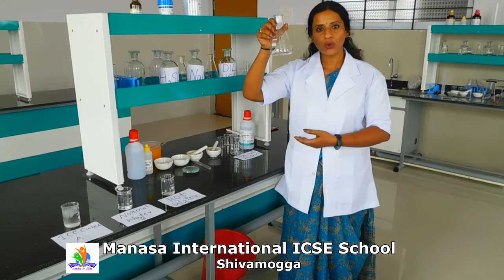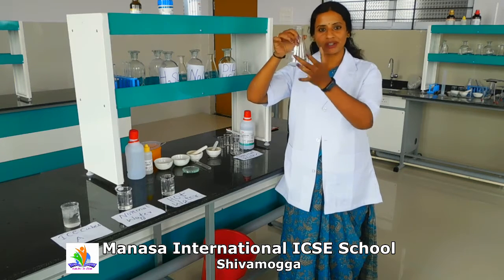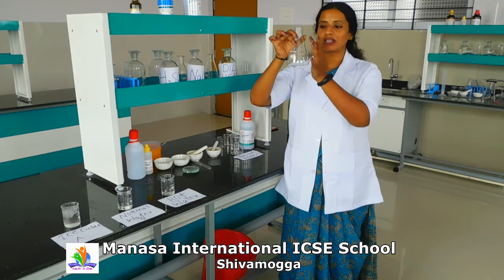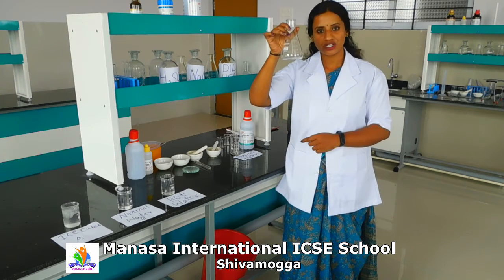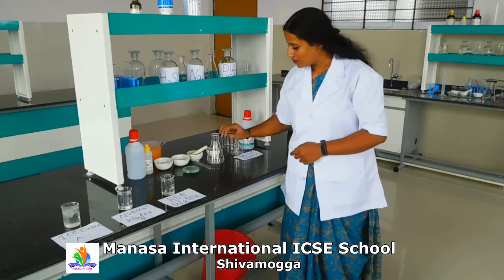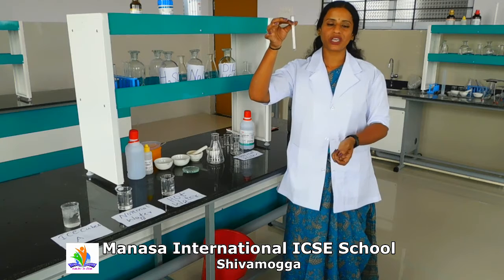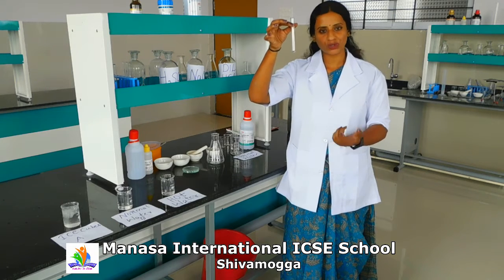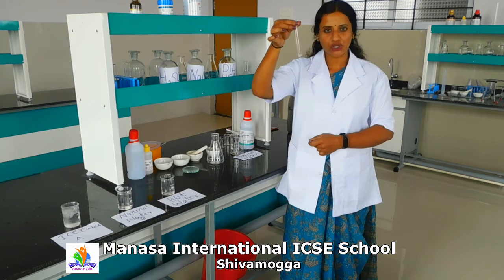This is known as the conical flask, named because of its shape. It is cone in shape, as we can see from its external appearance, and hence it is known as the conical flask. Next we have the test tubes. All the apparatus we use in the chemistry laboratory is made of borosilicate glass, and this is what we call a test tube.